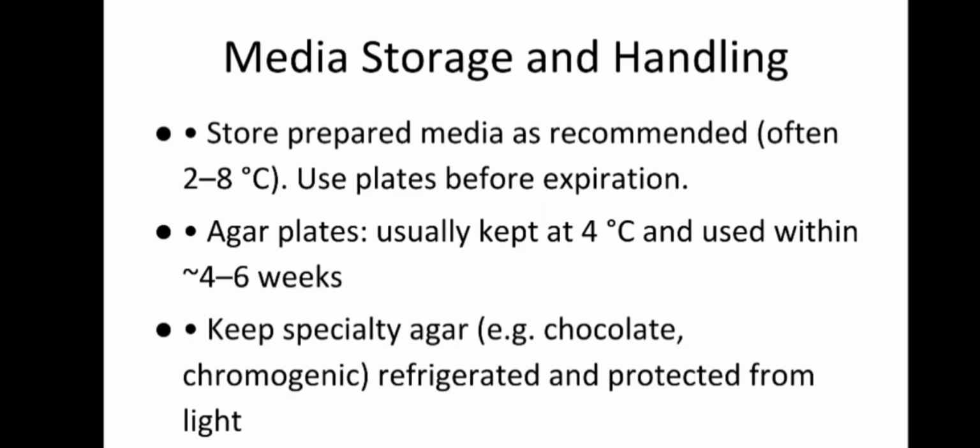Special media like chocolate agar has limited stability, so we usually purchase in small quantities based on use. For example, we keep chocolate agar and chromogenic plates at 4 degrees Celsius. Even then, agar plates remain fully viable only about 4 to 6 weeks at 4 degrees Celsius. It's quite expensive, so it's better to buy after planning properly.